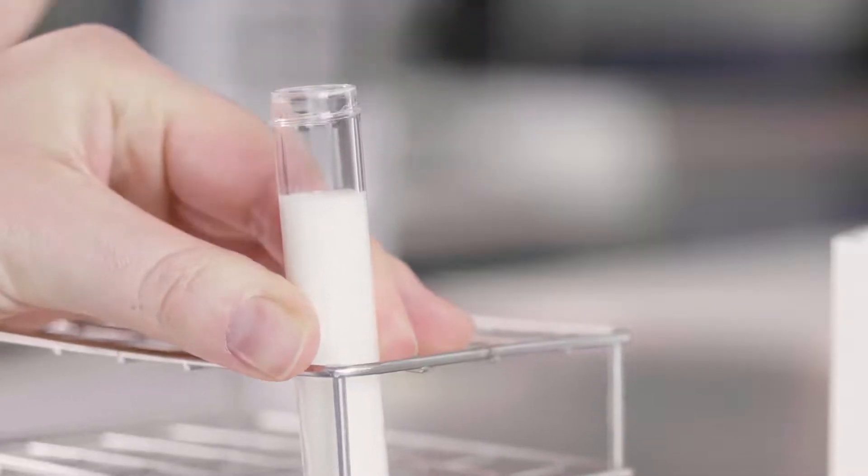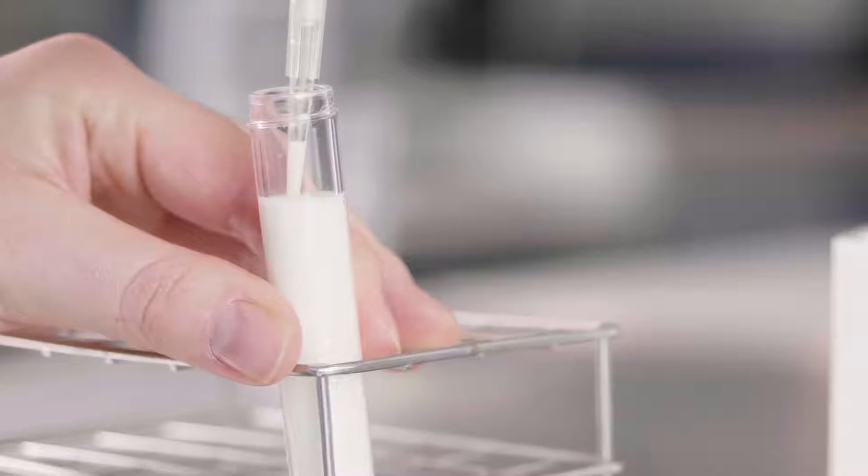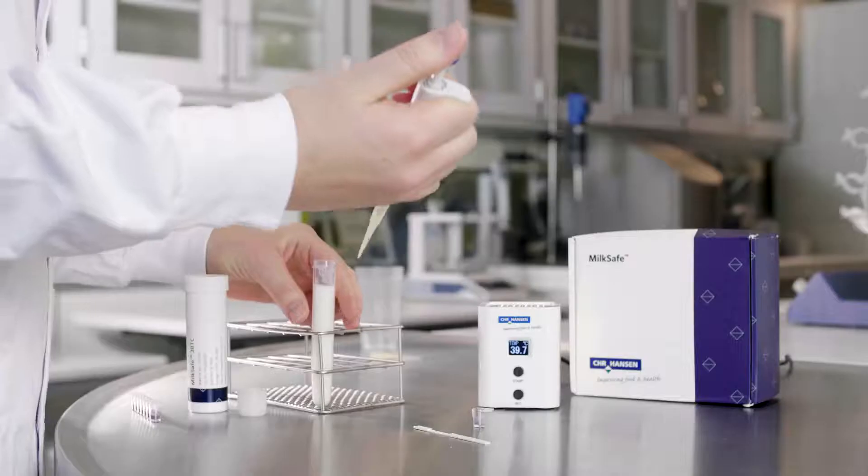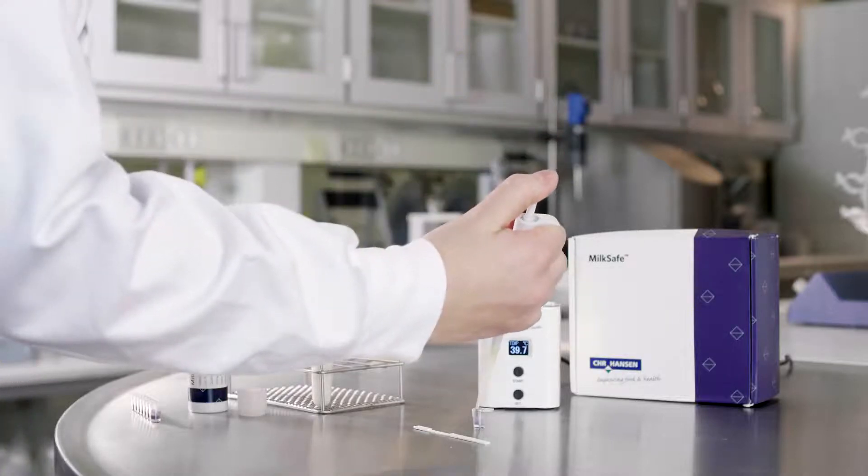Add 200 microliters of milk to the reagent microwell and mix by pipetting up and down until the color is uniform, approximately 5 to 10 times.